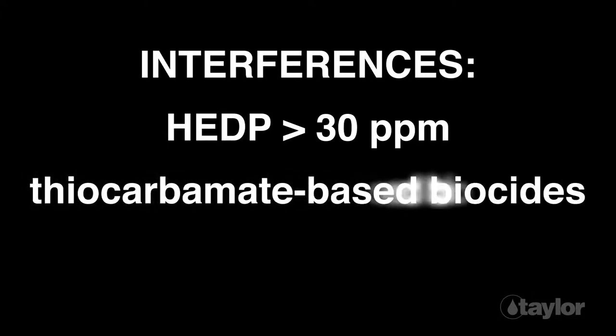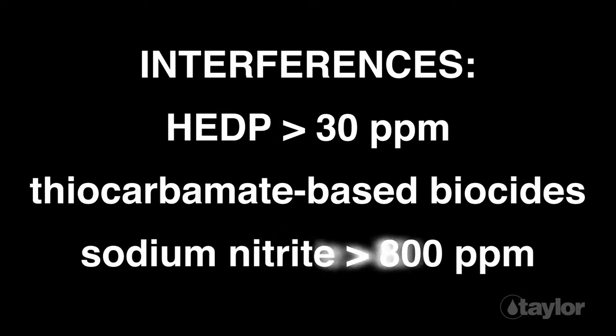Thiocarbamate-based biocides may cause interference. To prevent this, do not test while feeding thiocarbamates into the water system. Sodium nitrite levels greater than 800 parts per million may cause negative interference. To eliminate, dilute the sample with distilled, deionized, or molybdenum and nitrite-free water, and re-test.